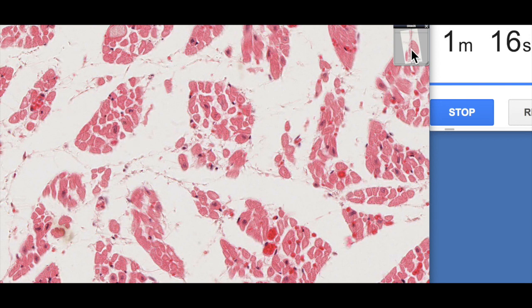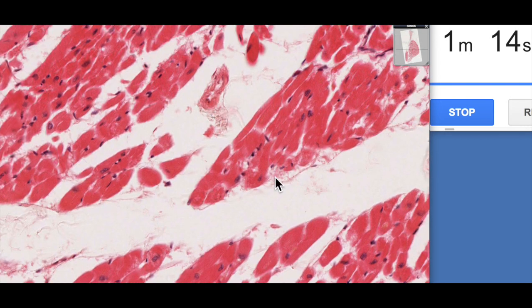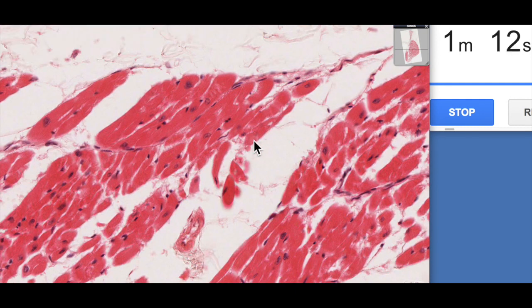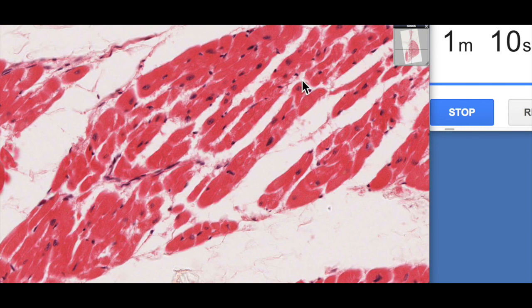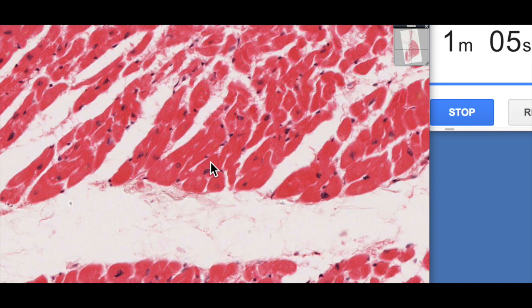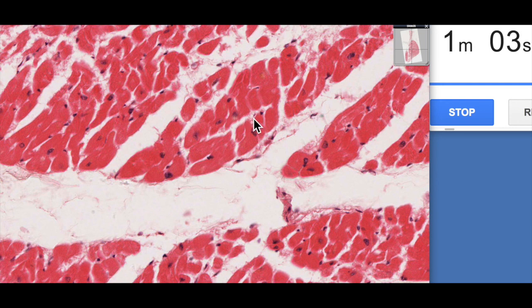When we actually have a look at the ventricular cardiomyocytes, they're much larger. Obviously most of these are obliquely sectioned here. If we were to have a look at some of these in longitudinal section, of course we'd see striations typical of cardiac muscle.